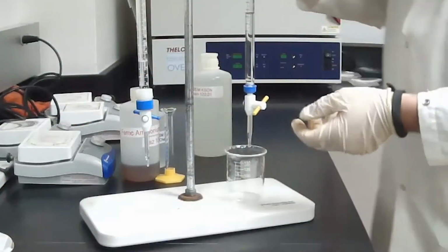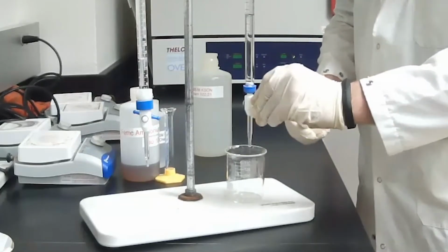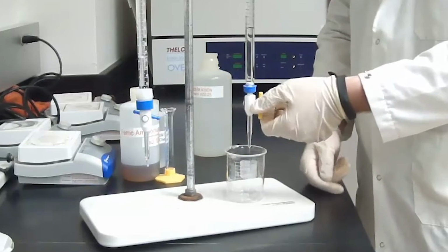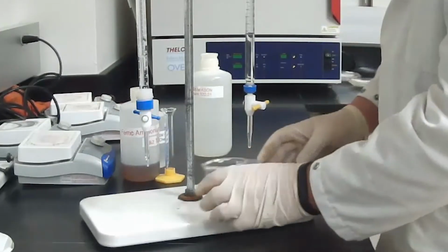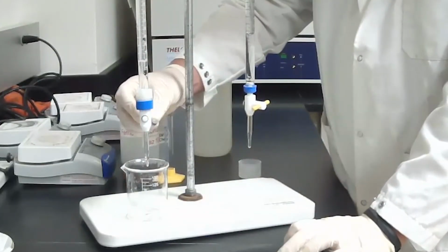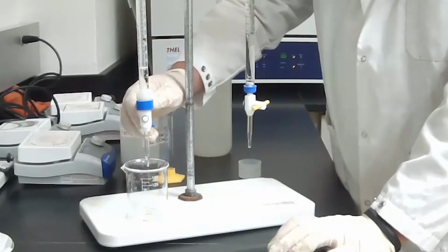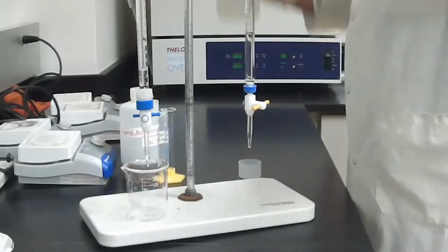And we use that to make sure that we rinse the inside, and then we open this a little bit, make sure that we've rinsed out the tip of the burette and make sure there are no occlusions. It's a good time to find out before you get ready if it's stopped up and you need a new one. Also, this allows you to find out if there's one you like better than the other, which I didn't do last time and paid for it. And it looks like they're both free-flowing, so we're going to go ahead and finish filling them up.